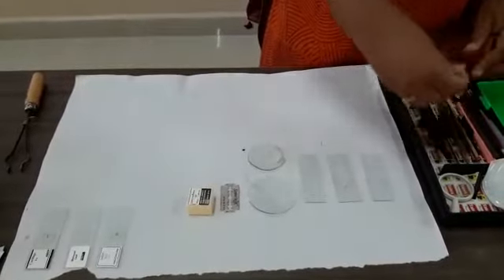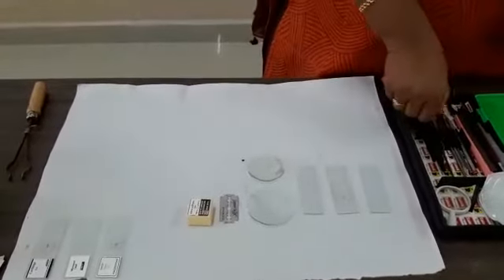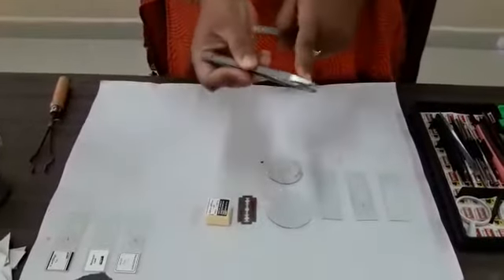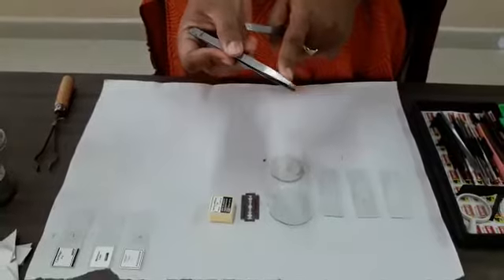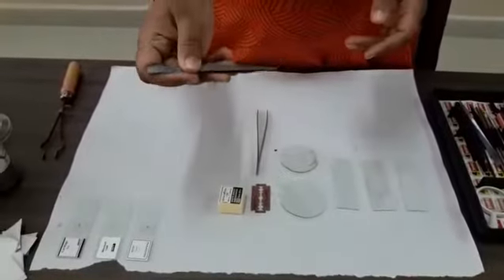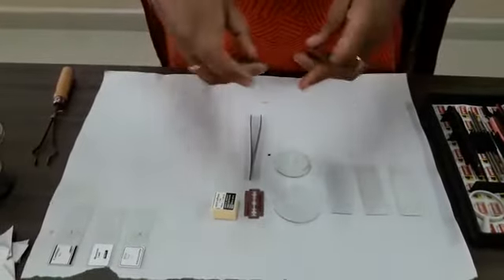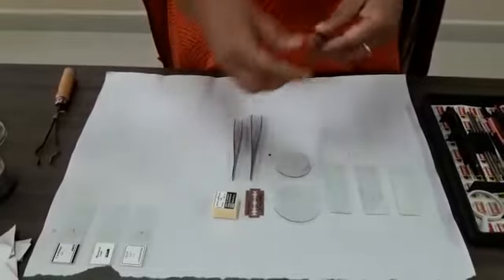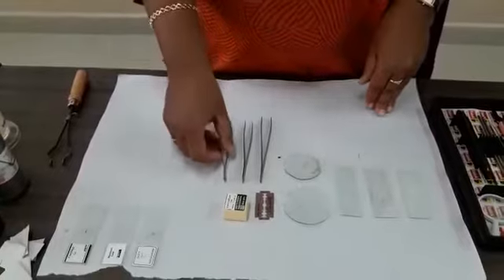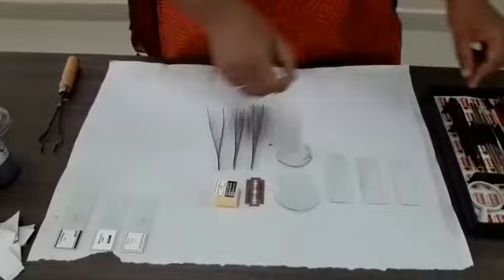There will be two forceps. This is the blunt forcep — it has blunt ends. And there is one more forcep which is called pointed; you can see there are two pointed forceps. These are very important for dissection — to hold any section or any delicate material. You can't hold it with your hands; you need to use these forceps to prepare the slide.